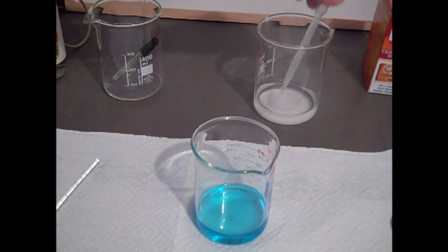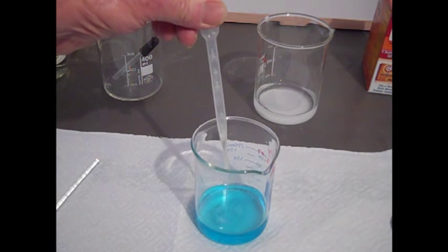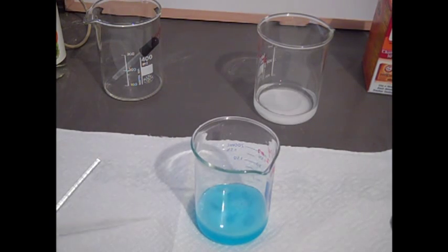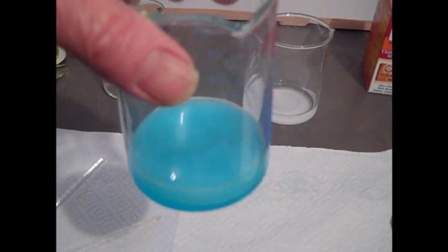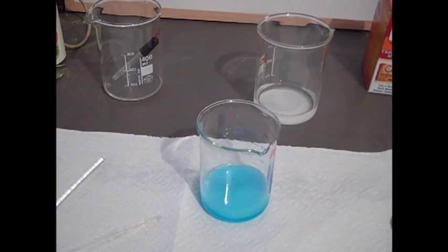First we're going to add the sodium bicarbonate, just a few drops. And hopefully you can see this well. I'm going to add another half of a dropper full. You might be able to see that. I'll bring the beaker up. It's sort of a pale blue color in there. That's about the best we can do. It forms like a cloud of precipitate.